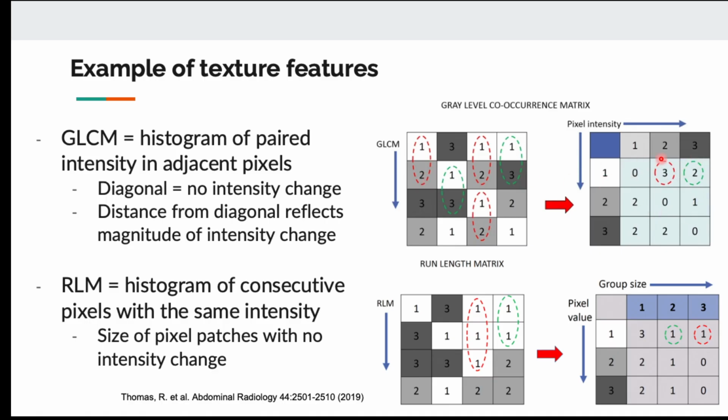So in the histogram, the first row and the second column, we're going to put 3 in here, because 3 is the number of pixel pair that have 1 and 2 next to each other. And 1 and 3, this is more change, more change from 1 to 3. It's more change than from 1 to 2. There are 2 places in the image. So in this case, the first row and the third column of our texture data will be 2 that designate these numbers of pixel pair.